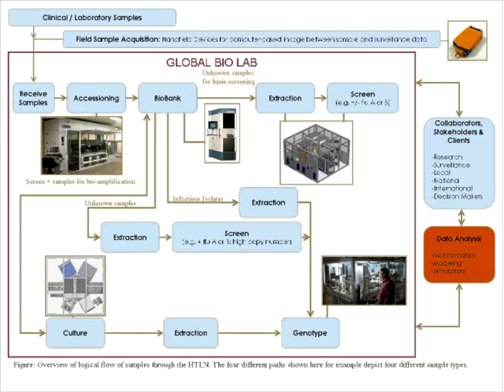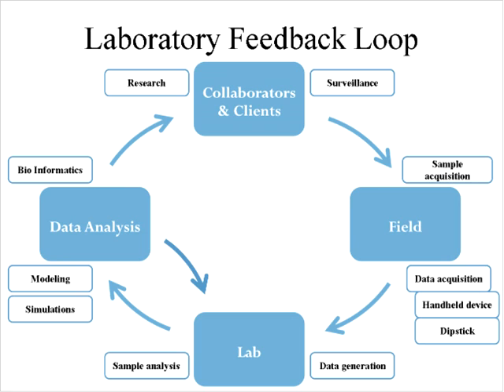Okay, next thing that I wanted to talk about, which I think is one of our key attributes, is the data analysis functionality within the laboratory. So one of the core concepts of this laboratory, again, is not just that there would be a LIMS system, but that there would be an integrated system where collaborators and clients would be able to deliver electronically their data that they're collecting in the field, from a variety of different sources, that we have that integrated with our LIMS system for generating data within the laboratory, and that all of that is then also integrated with the system that's used for data analysis, whether it's modeling or simulations or bioinformatics, and that there's an easy to use portal that our collaborators and clients can use to access that information at the end.